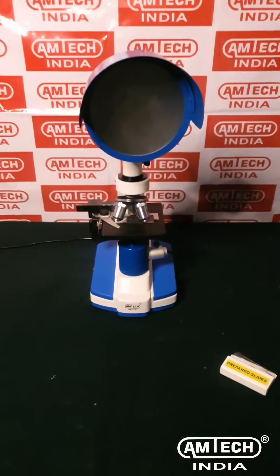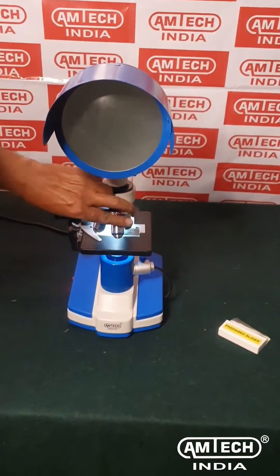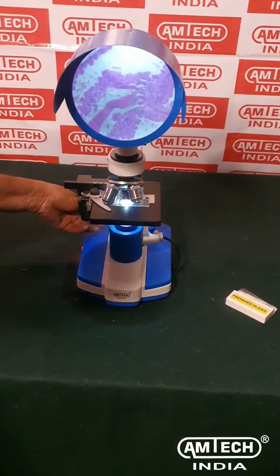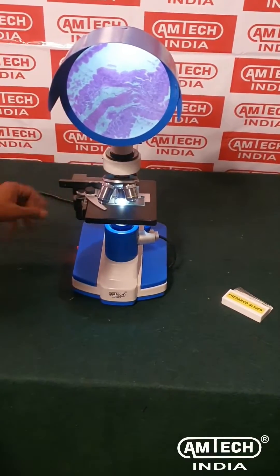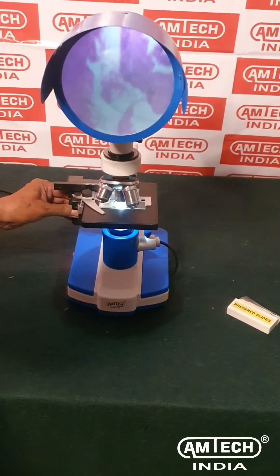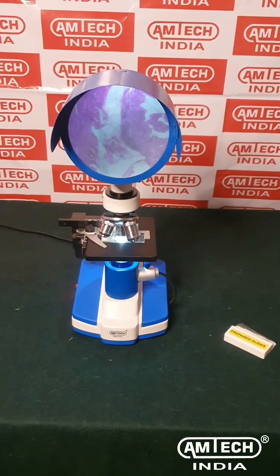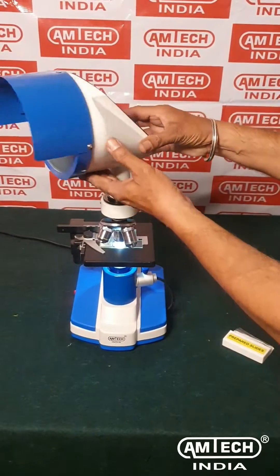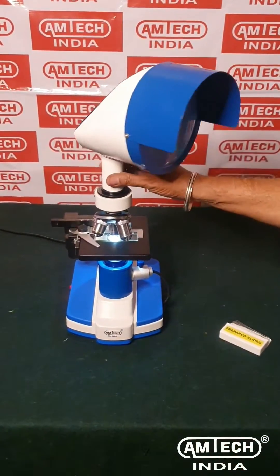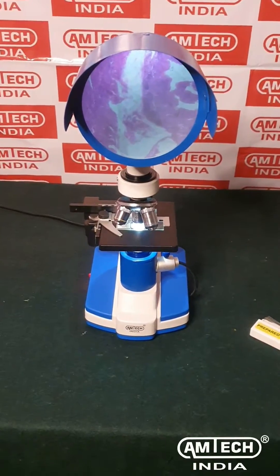Once the mains cord is connected, switch on the power button and revolve the turret to see different magnifications. Amtech India's Projection microscope offers magnifications 100x, 200x, and 450x. The microscope dome can also be viewed 360 degrees by loosening the dome screw.